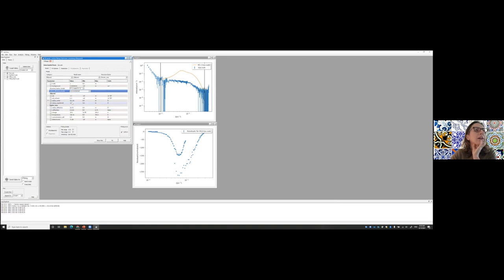Now, if you have a polar radius of 22 and an equatorial of 12, and again, that's in your instructions as well, if you calculate the volume of this ellipsoid and you work out an average radius, you'd get something around 15. So I'm going to put that as my starting number. And again, you would know this by reading the reference. It would tell you how to work with these parameters.